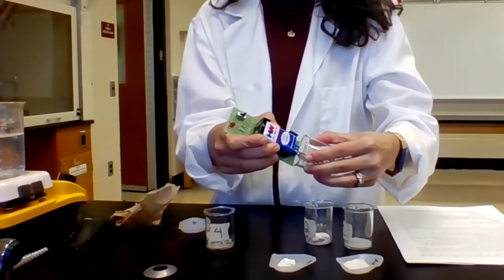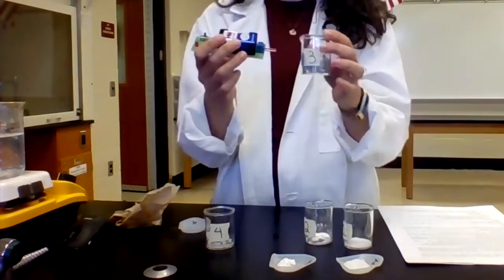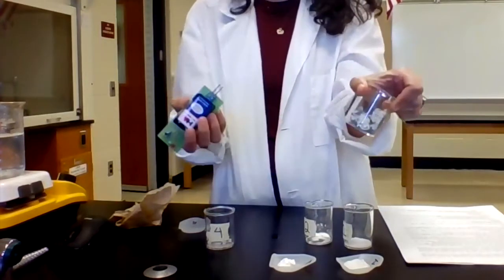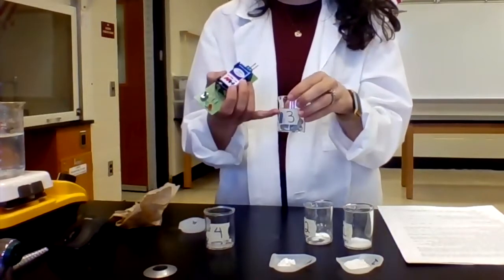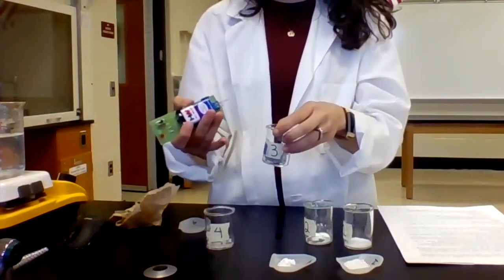You just have to make sure you get good contact with the solid. So the fact that solid 3 is conducting in the solid state, and also just from its general appearance as a shiny gray solid, this is telling me that solid 3 is most likely metallic. So I don't need to do all of these other tests that I am going to have to do with these other solids.